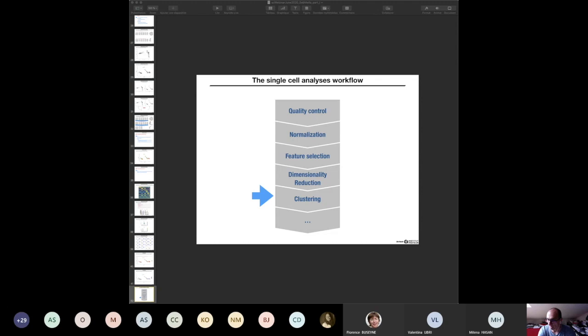I'm showing the analysis as if I was blind, using thresholds that I'm used to using, and they are adjustable. As I was saying, once you finish this step, you can always go back and say, maybe I should have gone to 25% of mitochondrial genes, or been more stringent, and then you redo the analysis.